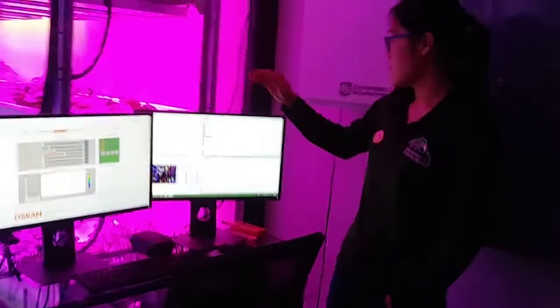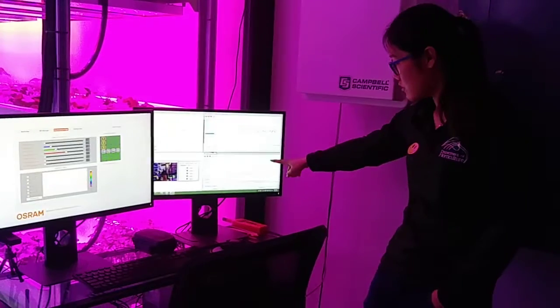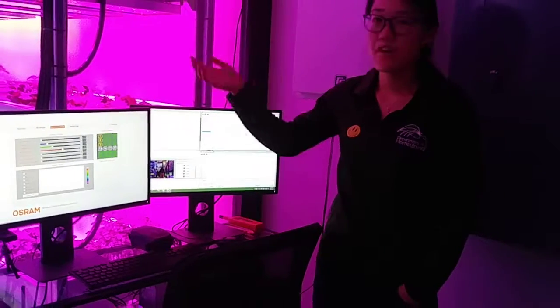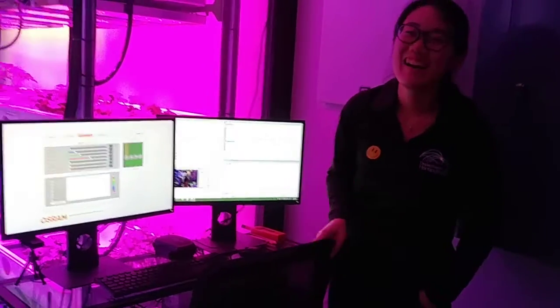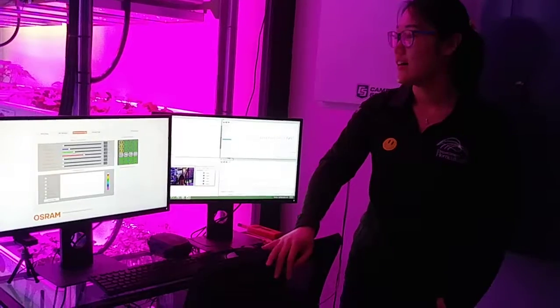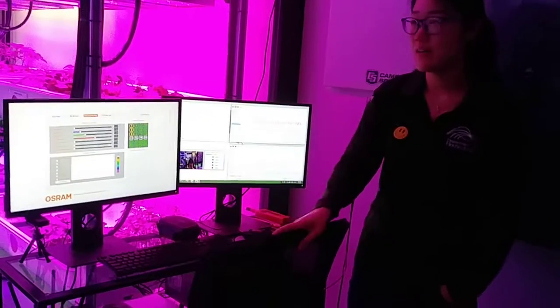Which means that if a group of people like them goes in and stays for a while, you can see the CO2 concentration actually bumps up, and it will go down when they come out. You can't get them to stop breathing? Yeah. We have fans in both of the rooms just to increase some air movement for better growth of the plants.